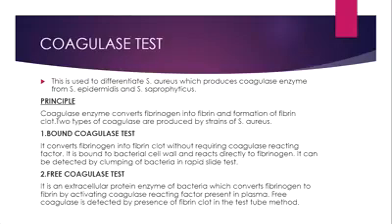The second test is coagulase test. This test is used to differentiate Staph aureus. Now the three of the Staphylococcus species, the Staph aureus, Staph epidermidis and the Staph saprophyticus. The Staph aureus produces coagulase enzyme, so it can be differentiated from the rest of the two that are negative for coagulase enzyme. That means they don't have this enzyme.